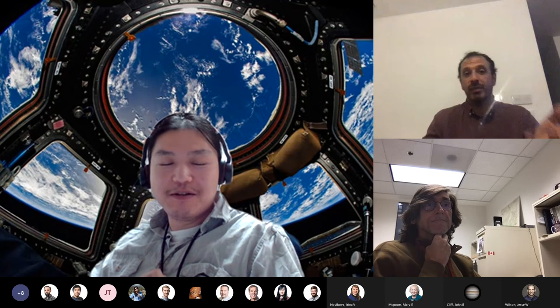An 8 minute LC is not bad. We often do an hour, 2 hours here. Okay, yeah, but if you want to screen 100... Yeah, I get it. Obviously we cannot do long LC, right? Actually there's a limitation even with long LC, because there's back exchange. The more time you leave it in the LC, the more back exchange you can have. Yeah, that's why the gradient is short in terms of time.